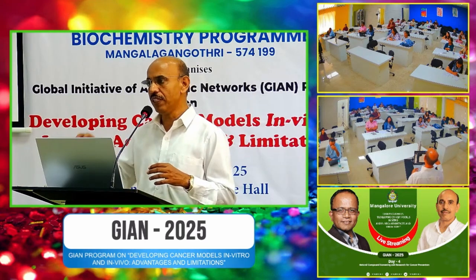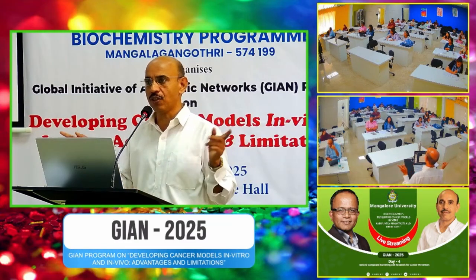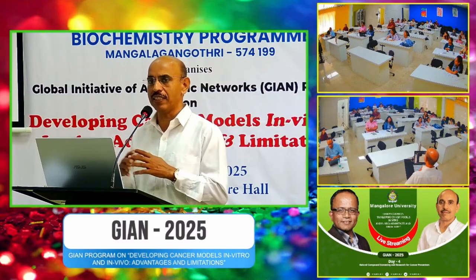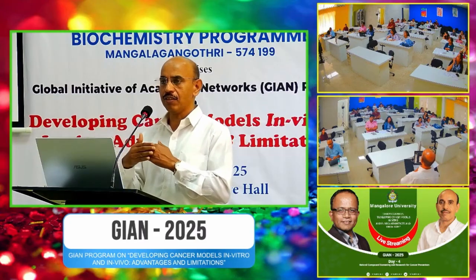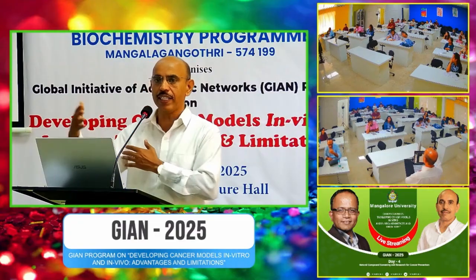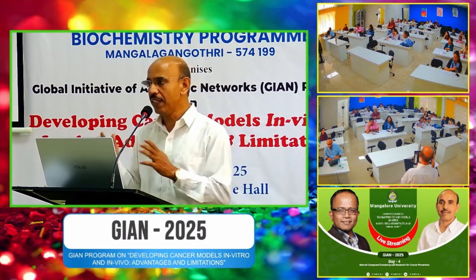Here what we will do, we have a lab, suppose, for example, I have this room and I cannot use it completely, because if my space is limited, I cannot use everything for the cell culture. The better thing is that you make a partition so that you can avoid so much contamination in that area. So by partitioning that area from the other area, because you are not only doing the cell culture, while doing the cell culture you are also doing various other works.